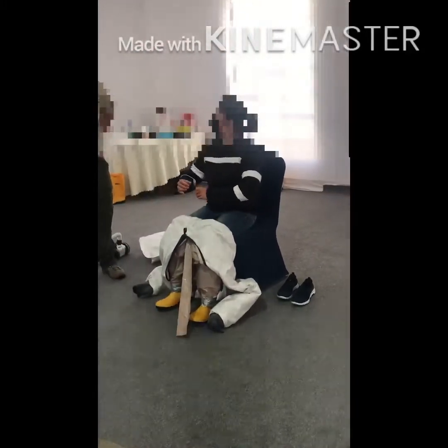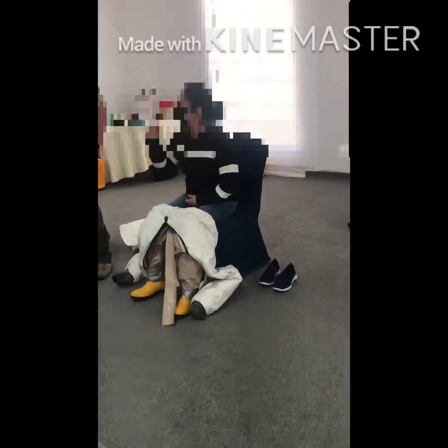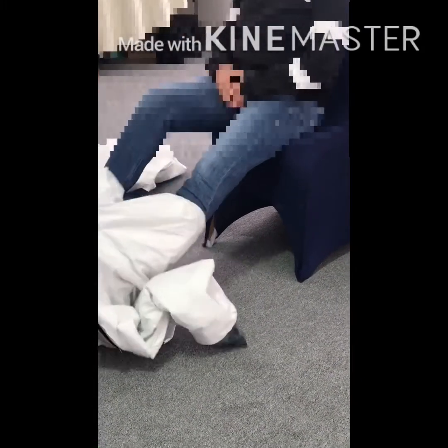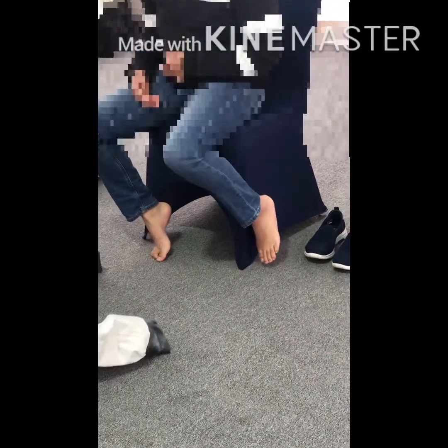Don't let them sit down till the suit is below the bottom. Because if I do have anything on the suit and I sit down on that chair, it leaks into the chair. Then when I do sit down on it without my suit on, it leaks into me. And we take the boots and the suit off together, so they stay together. And that all goes into my bin.